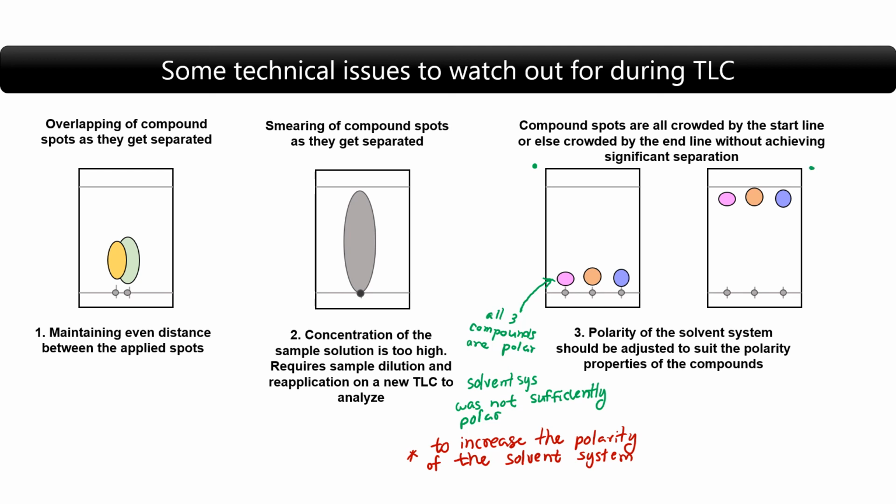All the compounds have crowded to the top of the plate. That means that these three compounds are mostly nonpolar, or else the solvent system was too polar.